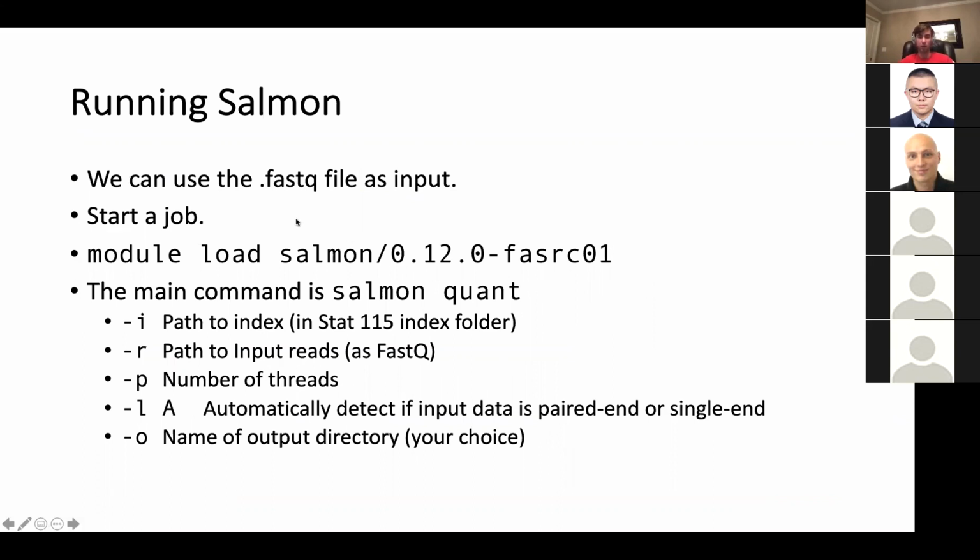So I think you want to give it a FASTQ file for this. They correspond: the BAM file for sample Y corresponds to the FASTQ file for sample Y. I think you can give it a BAM file as input. It would be interesting to see if that yields the same result. Probably will. But yeah, FASTQ as input.